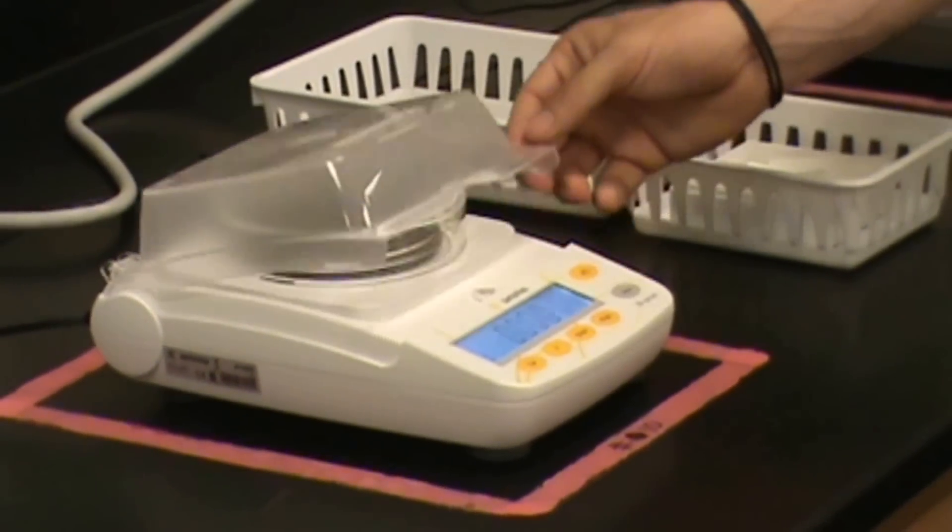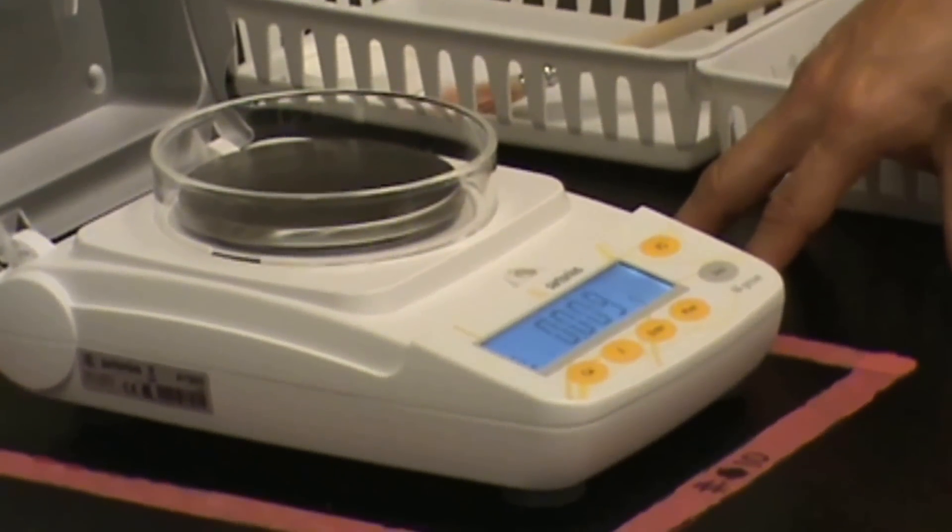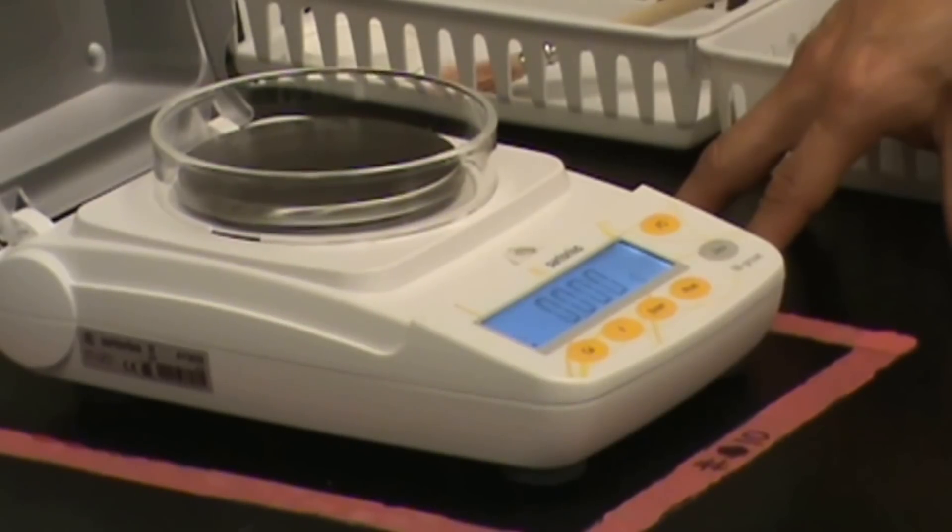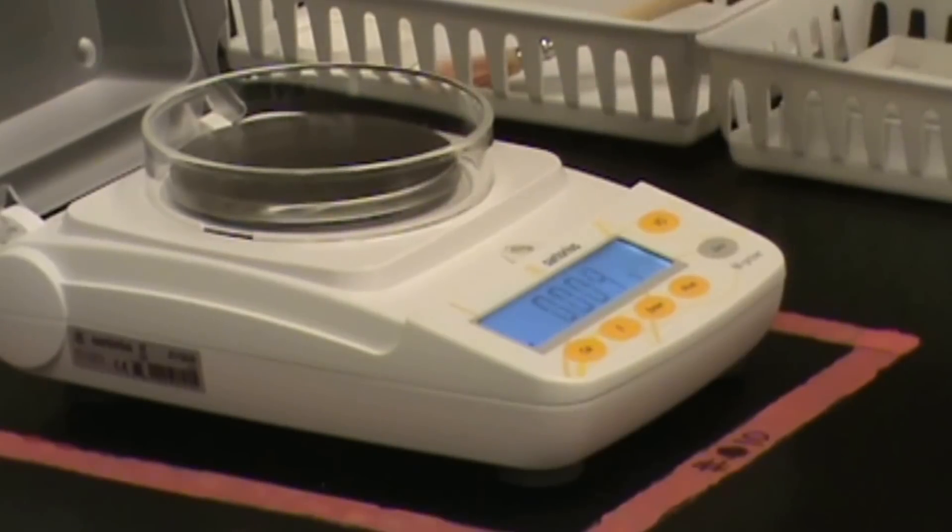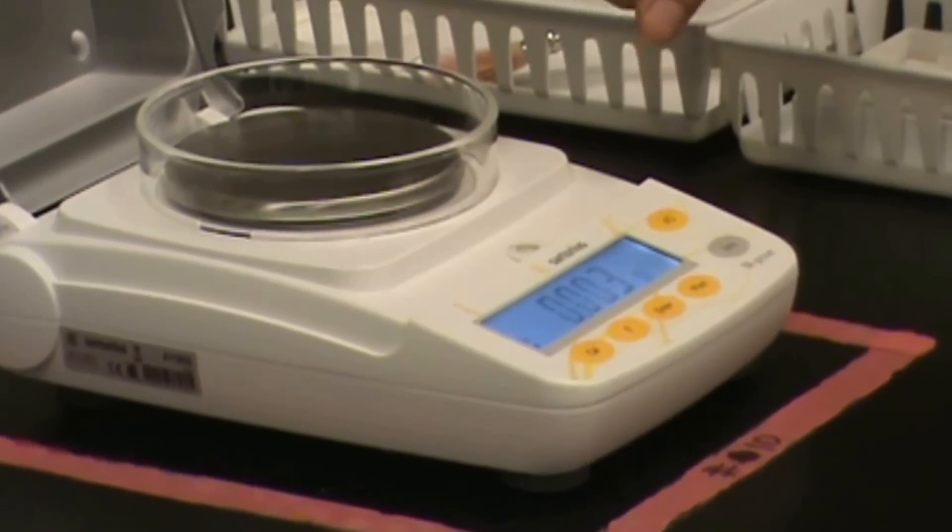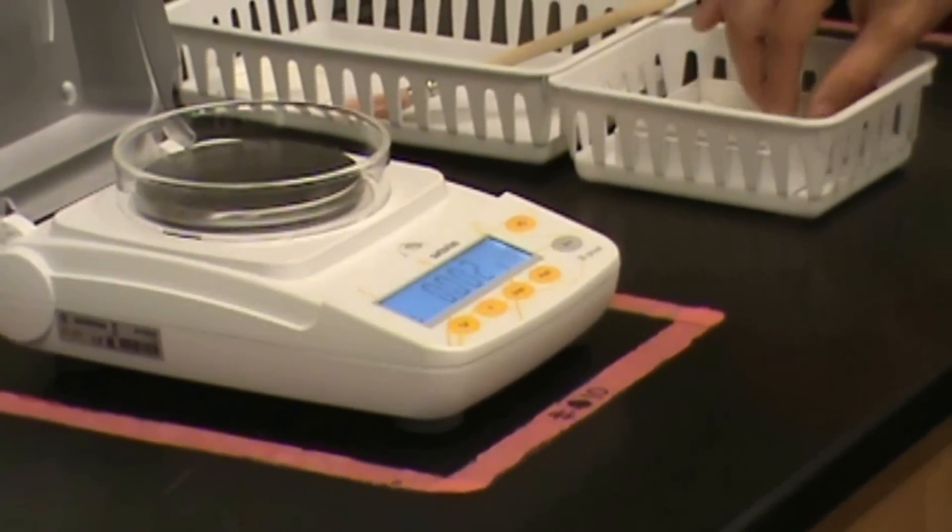I'm going to now open the wind cover right here to reveal the pan of the balance. A very important thing to remember when using a balance is that you never want to put chemicals directly onto the pan. You always want to use some sort of surface or container between the chemicals and the pan of the balance.